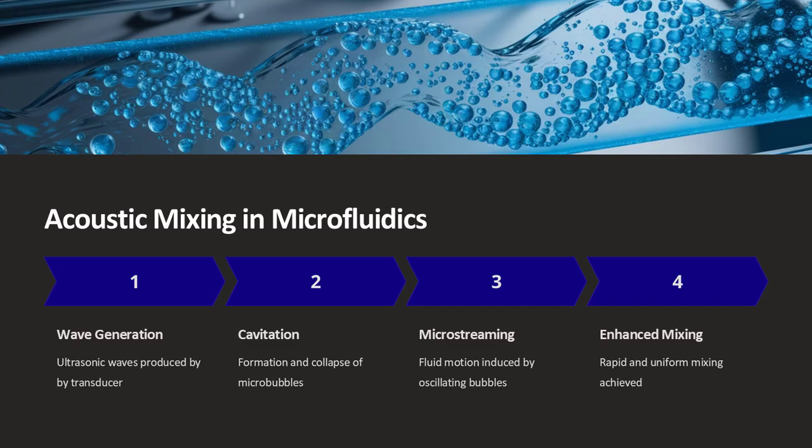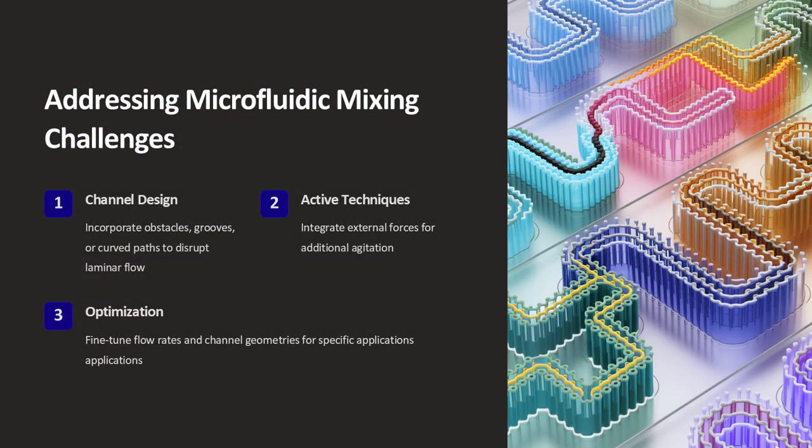In microfluidics, lamination mixing is often achieved using T-junctions, or flow-focusing devices that split the fluid into multiple thin streams before recombining them. This technique is particularly useful for reactions that require precise control of reagent concentrations, or when sensitive biological samples must be mixed gently without applying excessive shear forces.